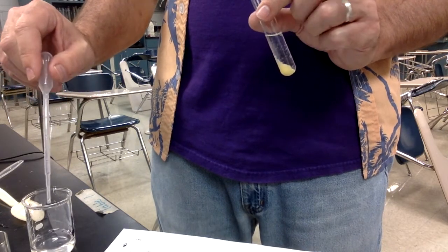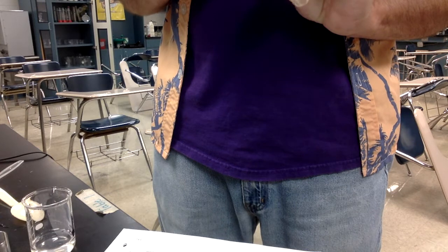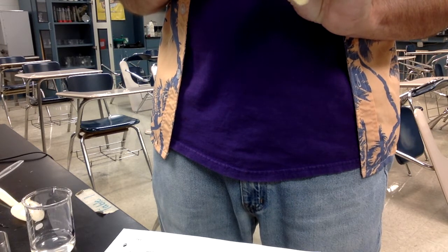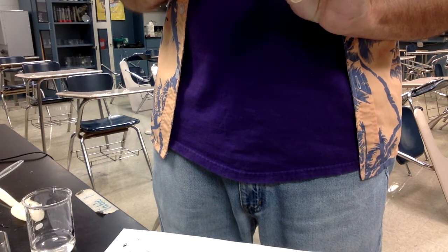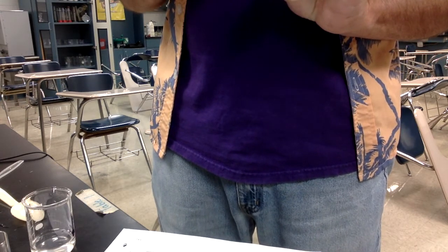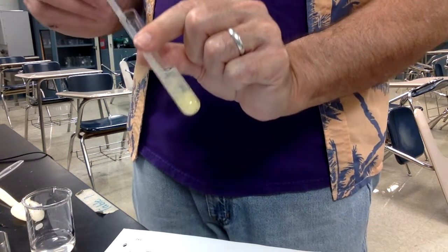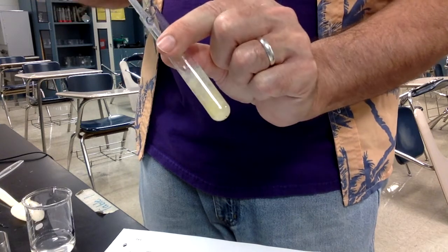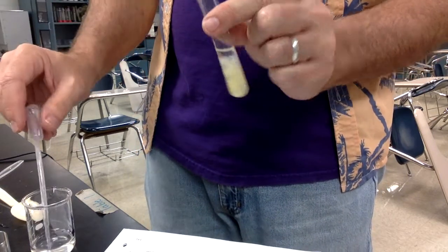It says use a glass stirring rod. I'm going to use the pipette here, breaking up that pellet and mixing it with that water there.